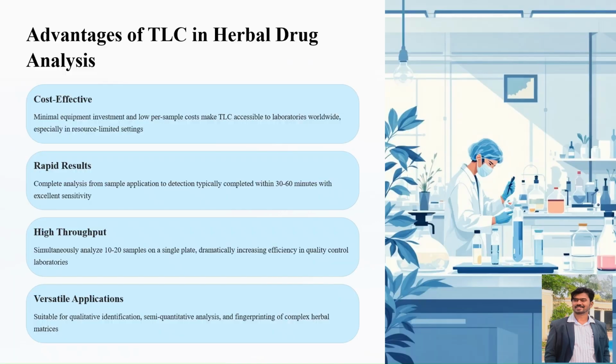Now the advantages of TLC: it's very cost effective, gives rapid results, high throughput, and versatile application. Cost effective, like in the case of HPTLC, the HPTLC machine cost is very high.